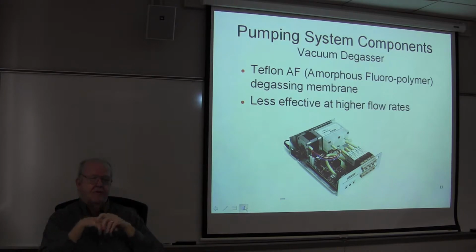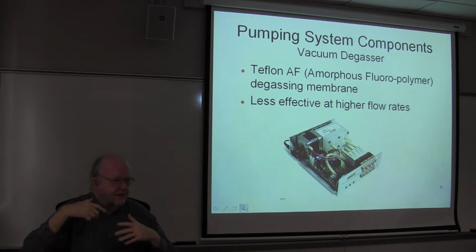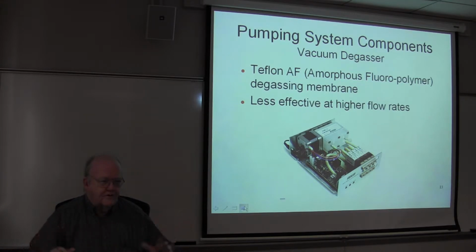And once you get a bubble in the pump, it simply compresses and decompresses the bubble. The bubble keeps getting bigger, smaller, bigger, smaller. No fluid, or not none, but less fluid than you anticipate comes out of the pump, and you've lost control of your flow rate. That's one evil.